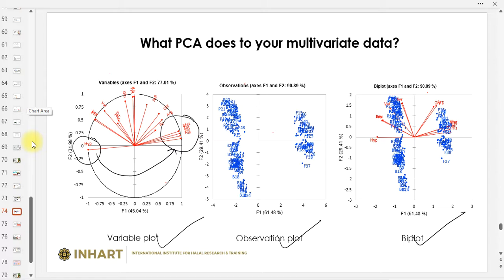So, what are the variables that may stay together and have positive correlation? This one. LEU and PHE. TYR and PHE here, sorry. Alanine and LYS, I don't remember exactly. GLU is located nearer. So they are positively correlated to each other. This one is also positively correlated. This one as well. These three can be grouped.